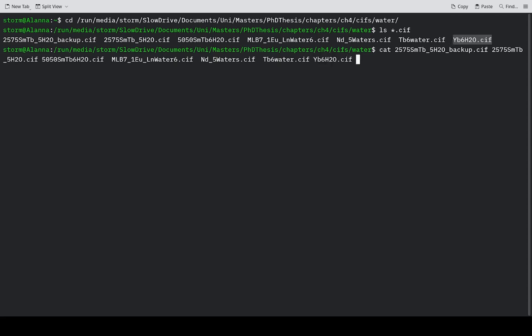Now, I just did that by double-clicking on each file name and then pressing middle click. Depending on your system, that might be a bit different. It may be with control copy and control paste. It may be with the command key and yank if you're an Emacs person, but it doesn't matter how you get them in there. You can use autocomplete.